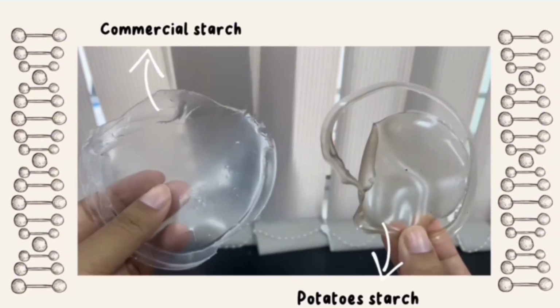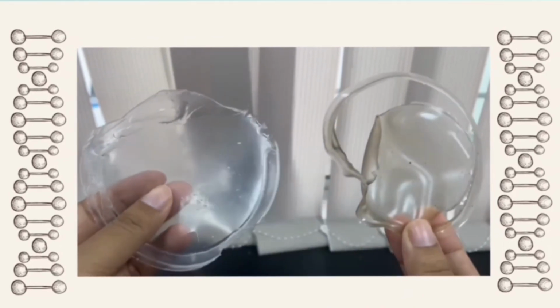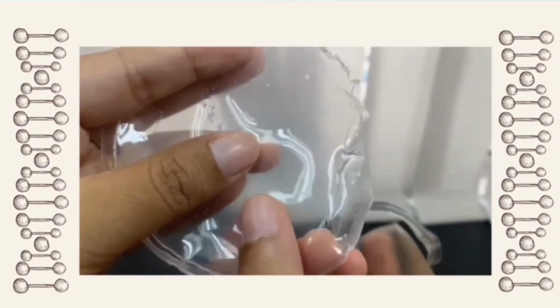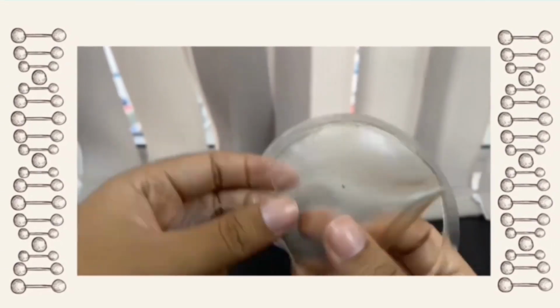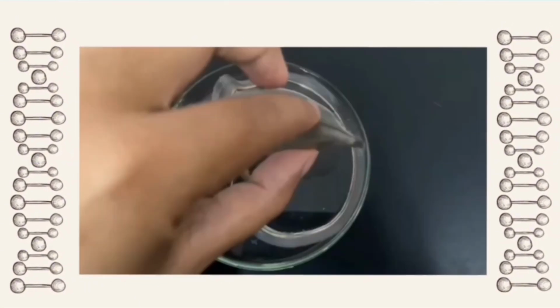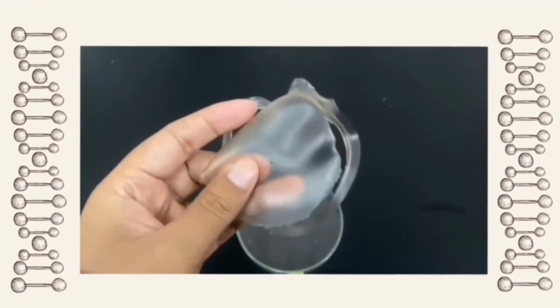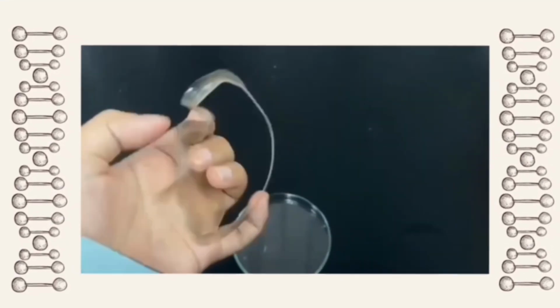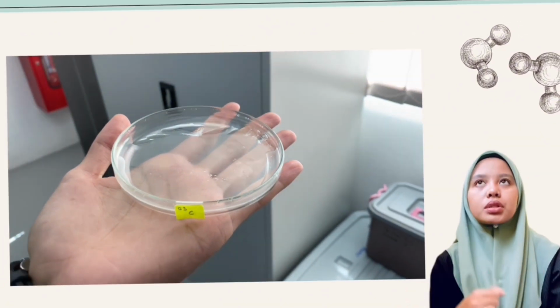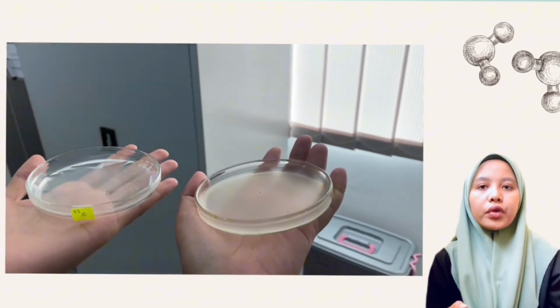As we can see through the video, once the plastic is dry, it becomes harder, but it will also retain a lot of its flexibility. Both bioplastics exhibit similar elastic properties. The bioplastic may not seem impressive at the moment, but it holds the potential to substitute petroleum-based plastics according to its elastic properties. For the discussion of the result, in this experiment, we produced 2 types of bioplastic as shown in the video. It uses 2 different sources of starch, which are commercial starch and starch extracted from potato.